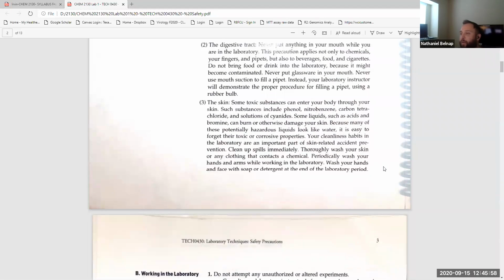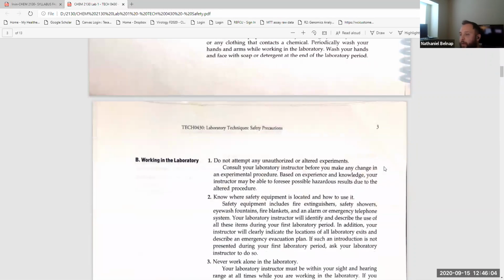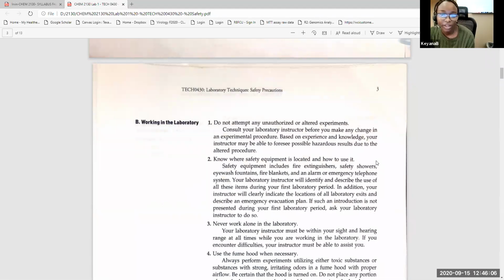I think it said 20 minutes in the book. That seems excessive, but if that's what it said, then yeah, sure, 20 minutes. I would personally say about 30 to 45 seconds, but I think it says for a small burn in the book it's 20 minutes. If it burns you badly, I mean, if it's 20 minutes, 20 minutes, but that seems a bit excessive.